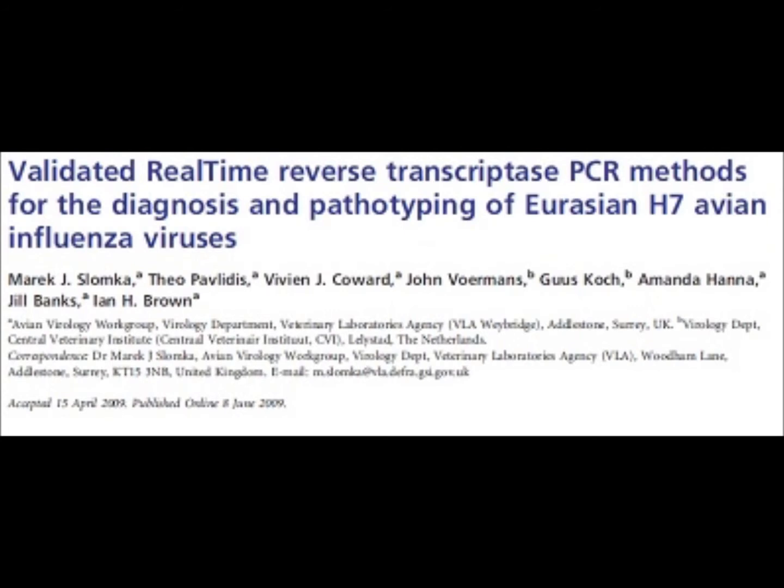What are the limitations of liquid RT-PCR assays? Well, RT-PCR assays in liquid form do work very well, but some of the limitations would be in how much sample you can put into the reactions. So that's one of the things. The other aspect of this is stability. You have to make sure it's stored at -20 or -70 or some cold storage place to ensure that the reactions work down the road.